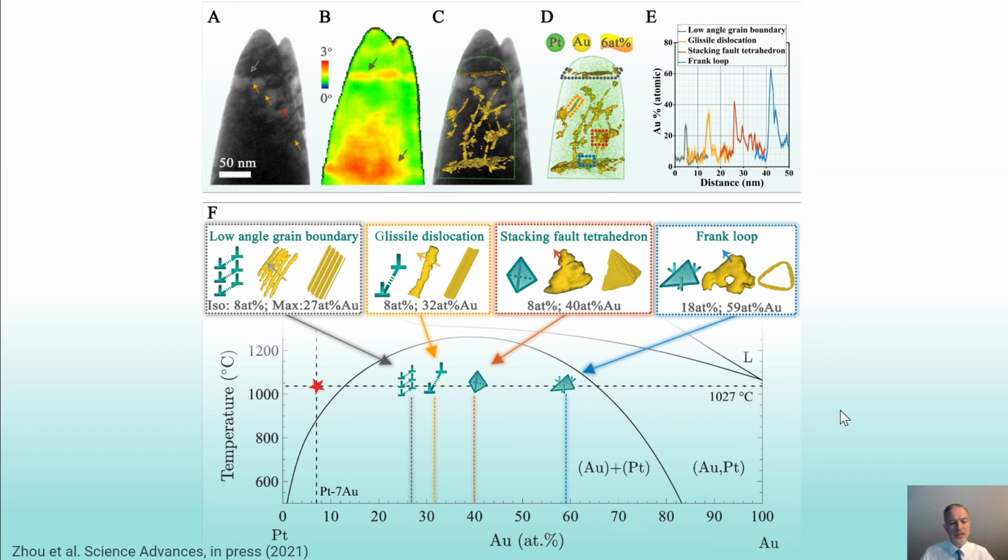That means the chemical decoration of the dislocations is not only a specific feature of one dislocation as such, but of the exact array in which you place it, of the exact distortion field and nanostructure that surrounds it. So it's a very, very complex interplay between the type of defect, the arrangement of the defects, and the chemical decoration state.